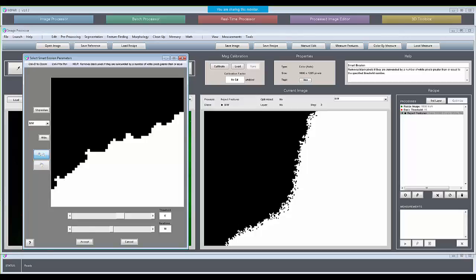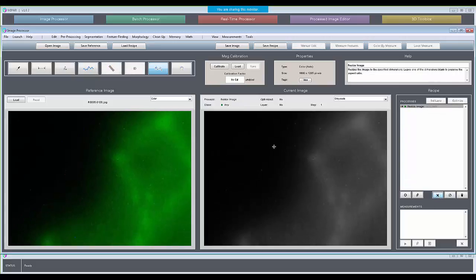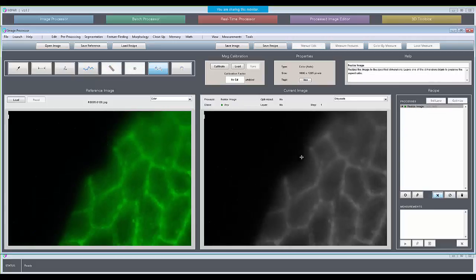Excellent point there by Dirk. I'm so used to just doing basic threshold and inverting for problems like this that I forget that we have range threshold that can forego the inverting. So let's back out here actually, and instead of the basic threshold, let's do that, because we do want the bright areas, as Dirk pointed out.